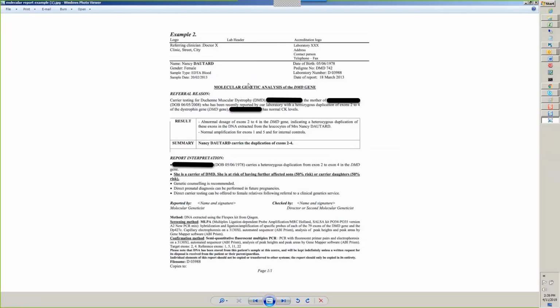That's a patient name on, yeah. I think we all noticed that. What's that? It has a patient name on it. Nancy Doddard? Yeah, that needed to have been redacted. And again, this is a sample that I picked up off of the internet, and I didn't see those.